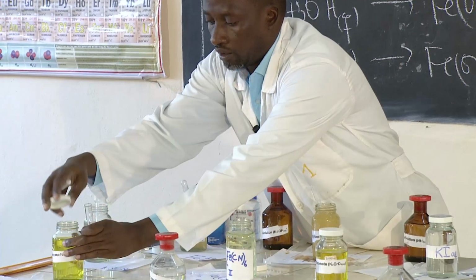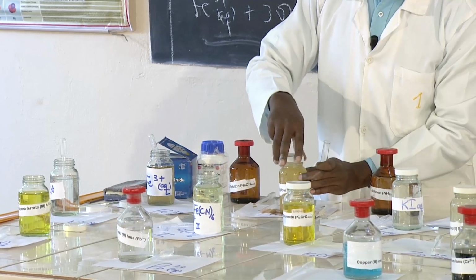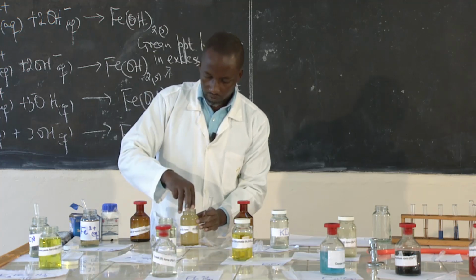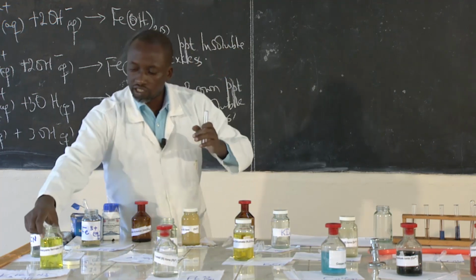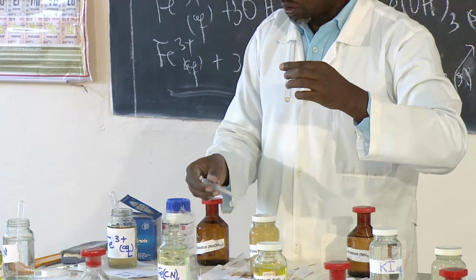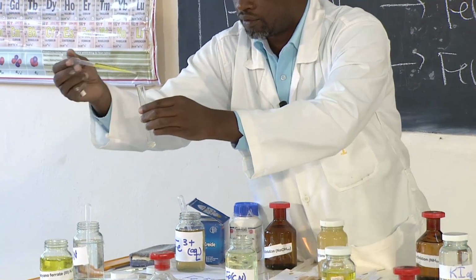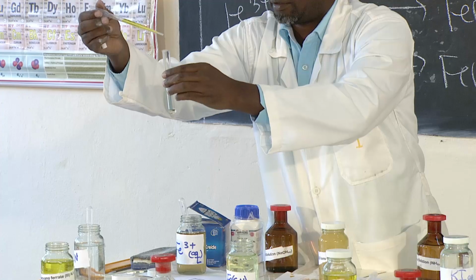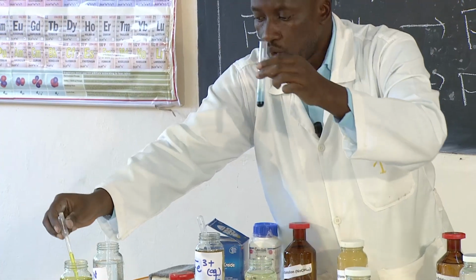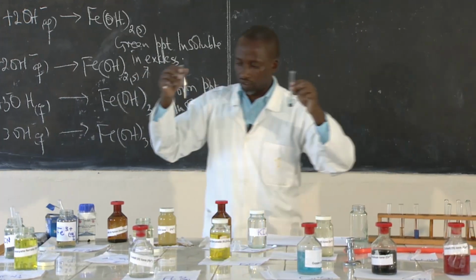Then now we'll add potassium hexacyanoferrate 3 to iron 2. Iron 2 with hexacyanoferrate 3. Can you see what is happening?